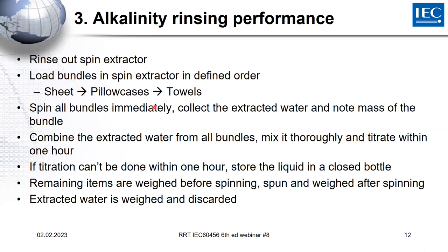If the titration can't be done within 1 hour, you should store the liquid in a closed bottle, because by taking up carbon dioxide from the surrounding air, the pH value can change a little bit. That will give you a wrong or changed result.